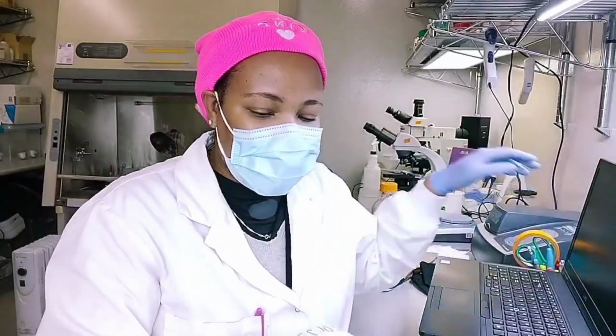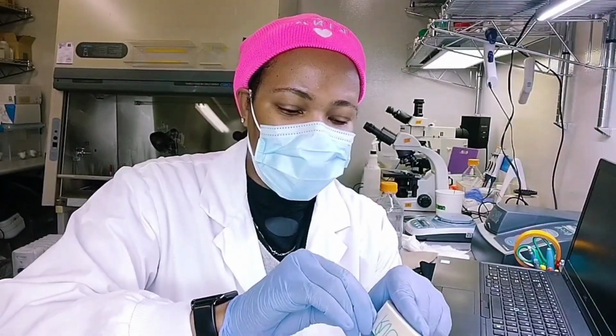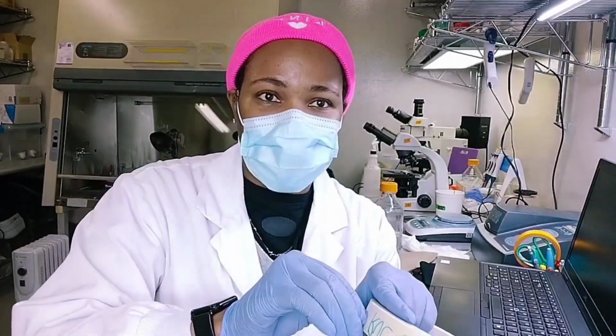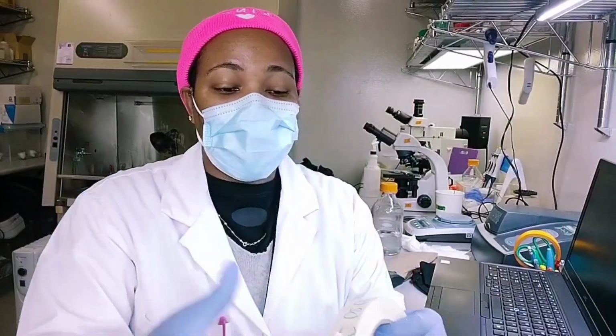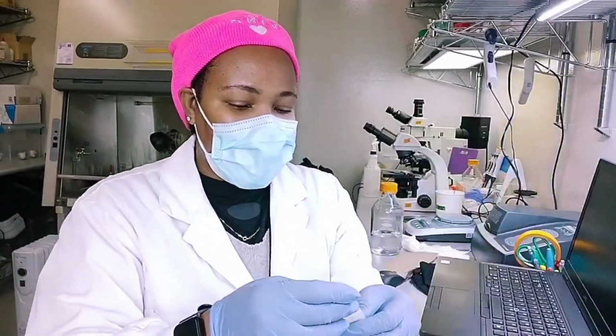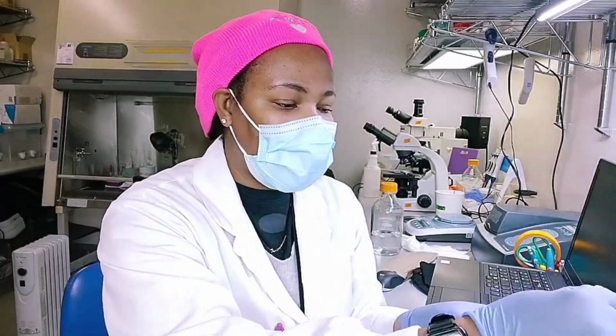Just in case, while I'm doing something else, my run is done and someone needs to use the autoclave, then they know it's mine and they can take it out, leave it in there, or bring it into the room for me. Or if something goes wrong with the autoclave while my run is in it, then they can let me know. That is where I created the autoclave logbook too, just in case something goes wrong, you can write it in and people can know.